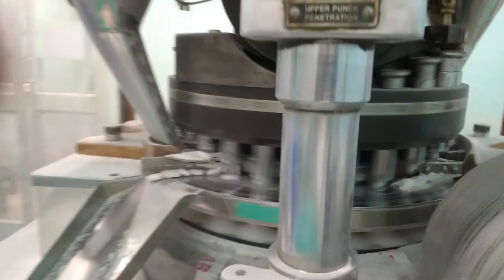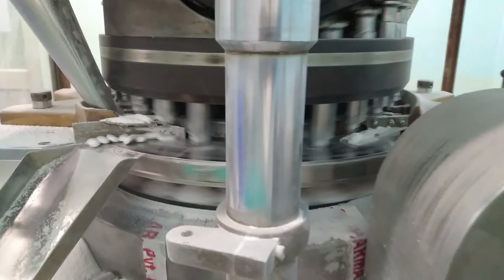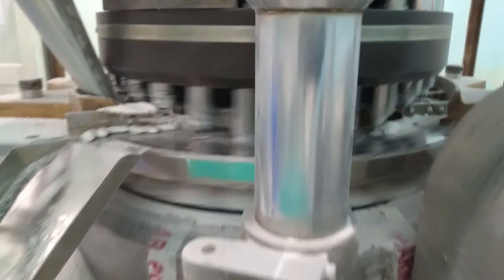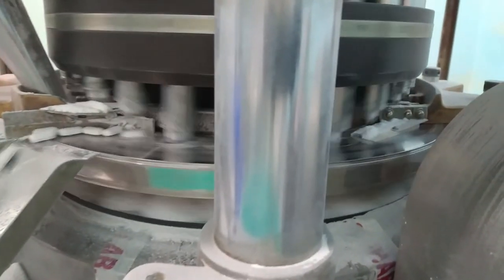Due to the COVID situation and lockdowns going on in different parts, students are unable to do industrial training. In a series of videos, I plan to give students an idea about real machines and their working. This video will be on compression machines — we will see how a real compression machine works.